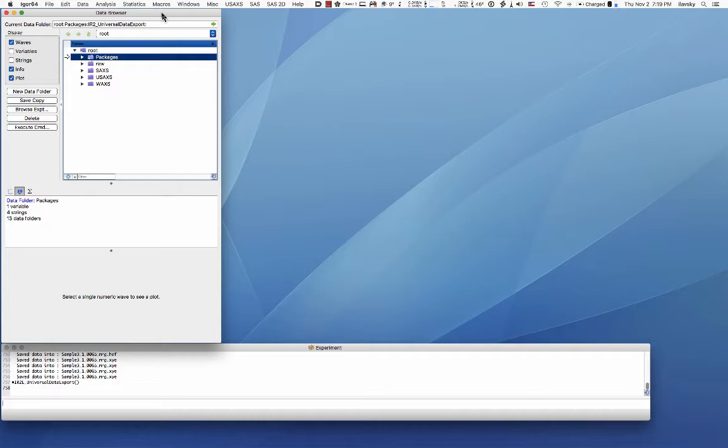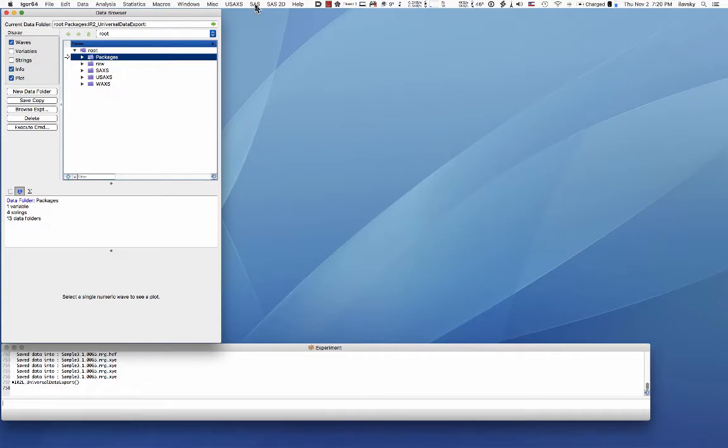Now for that I have to first explain to you that there are two types of naming systems which are different. Actually with IRENA results there are three. So let's start with what data we have.